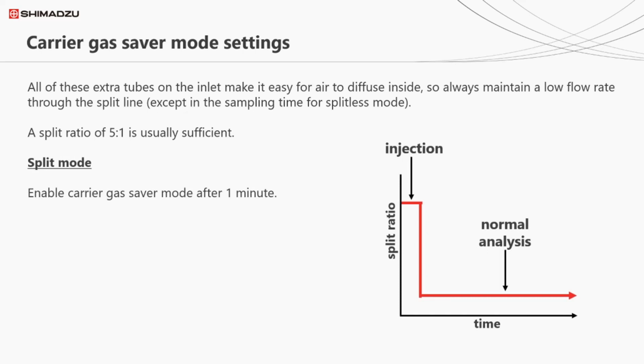Typically in your GC software, there will be an option to activate gas saver mode. This reduces the split ratio to a lower value of your choosing, typically 1 minute after injection. The same function will return the split ratio to a higher value, ready for injection of the second sample. This is more useful than it sounds. Smaller split ratios require less gas to operate, so by running in a small split whenever possible, the consumption of gas is minimised.